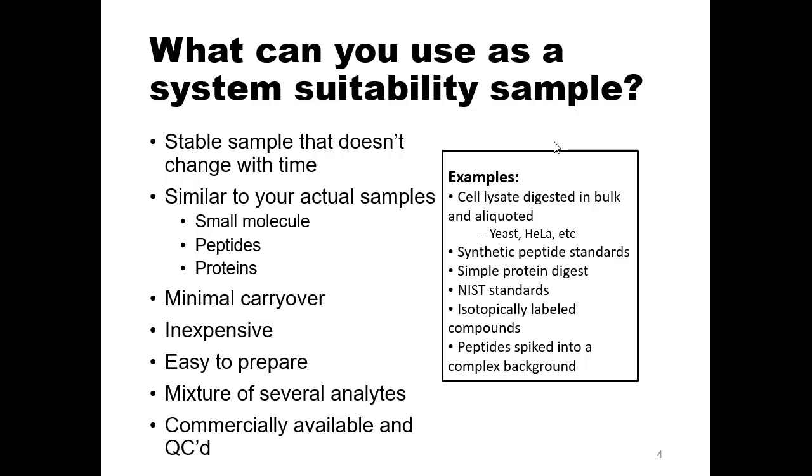You dump in your HeLa files in a folder, and then it automatically uploads the raw files, and you can access it via website and look at tons of different jobs. So that's monitoring an aliquot of HeLa sample. Yeah, I'd say HeLa is probably the most common I see. QC loud? Qcloud. Qcloud. Clever.